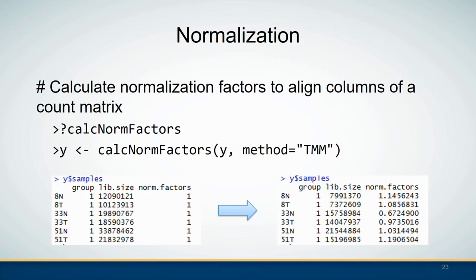In edgeR, the normalization factors are calculated using the calcNormFactors() function. If you don't know how to use a function in R, always put a question mark in front of it and the help documentation will give you detailed instructions on how to use that function.